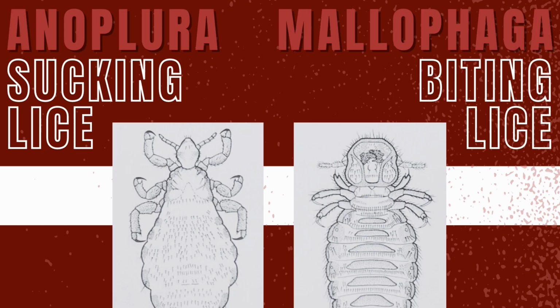Chewing lice have ventral chewing mandibles. They feed on epidermal debris, primarily skin scales, sebaceous secretions, and feathers if applicable. The heads of the chewing lice have a blunted appearance, with the head being wider than the thorax.